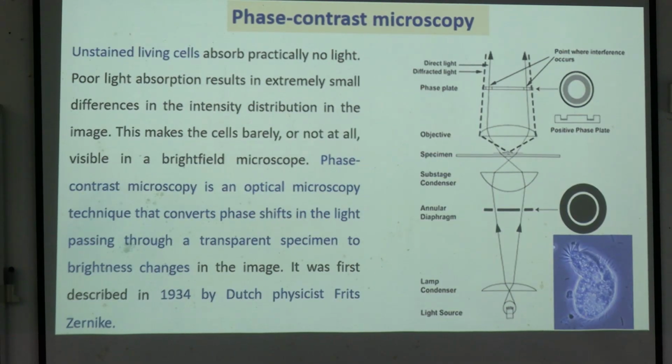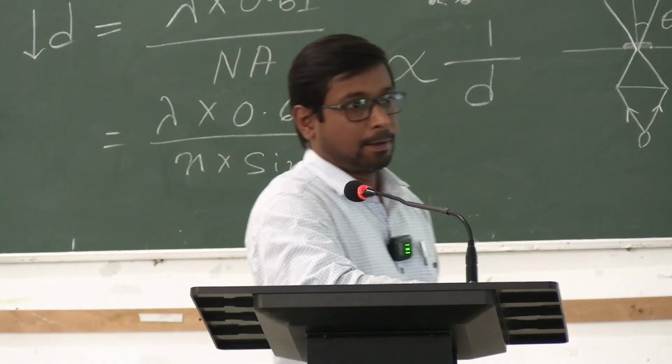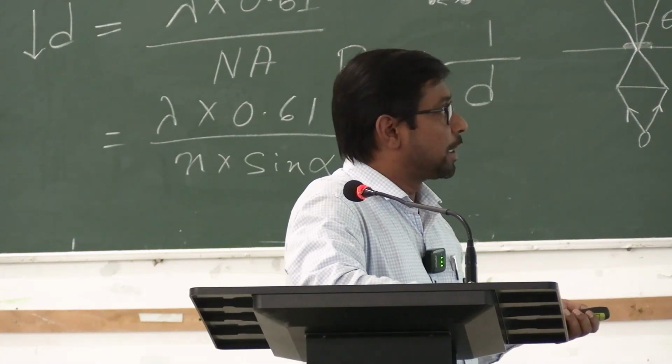Here, we are not satisfied; we want a more clear picture to find some extracellular apparatus or other organelles like flagella, cilia. We want the best resolution, best background. That's why we have developed the phase contrast microscope. The difference between phase contrast and dark field microscope is that in phase contrast one phase ring is there, and we have the annular ring also.